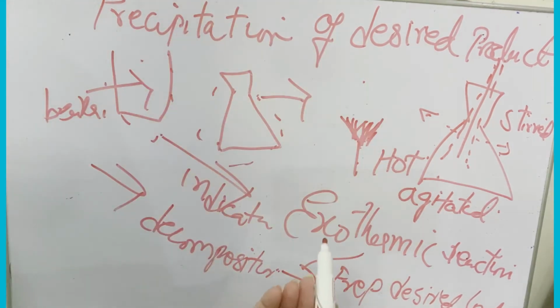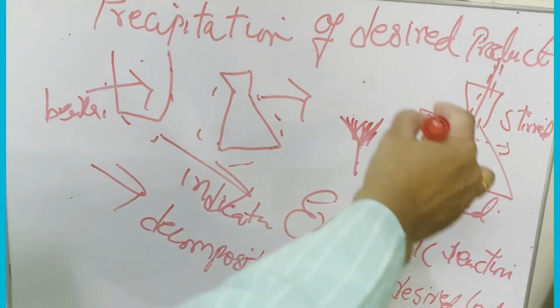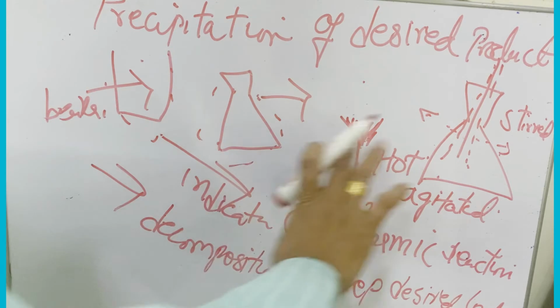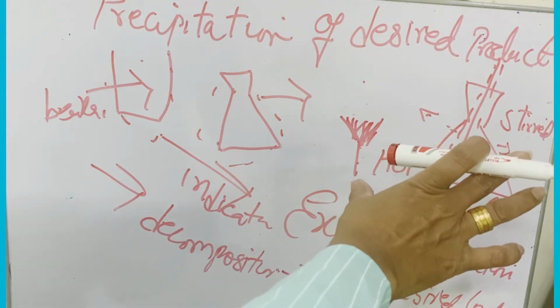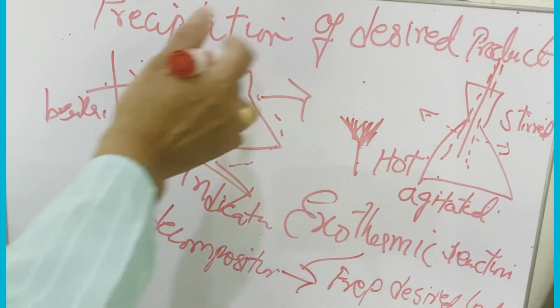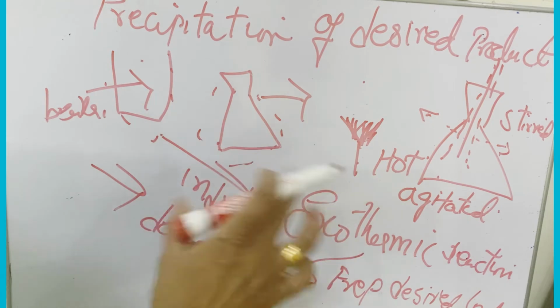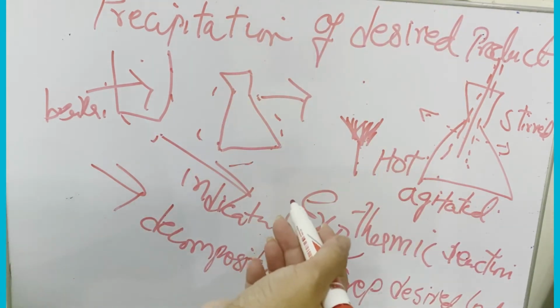Or by mechanical agitation. Now there are other methods also, in which you have the magnetic stirrer, which has the capacity of keeping a number of bottles in one stand. It's a stand-like thing, plugged into the electricity, and it's mechanical, so you do not need to do it manually. It keeps on shaking up and down, or right or left. So there is another way also, that is, the mechanical agitation.